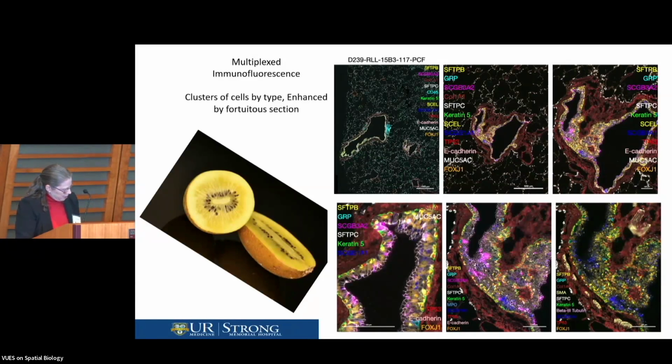And we can ask, again, new biological questions. Are these cells clonal? Are they interacting? Are they more likely to form cell type pods like this with disease, like asthma or smoke exposure? And are they like this only at those branch points, the nodes that I showed you in that CT scan, where the airflow is turbulent and there may be more damage to the epithelium? So these things we're hoping we can identify in 3D.